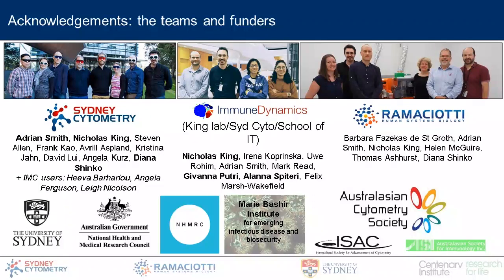Yeah, I think our current approaches work okay, but they can definitely be improved upon. There is, in fact, a whole area of machine learning and deep learning which has been developing approaches to cell segmentation over many, many years. And so there is a wealth of background there that can be drawn on, but fundamentally, those areas haven't been using multi-dimensional data like the type we generate with the IMC. And so it seems trivial, but it actually does change things.